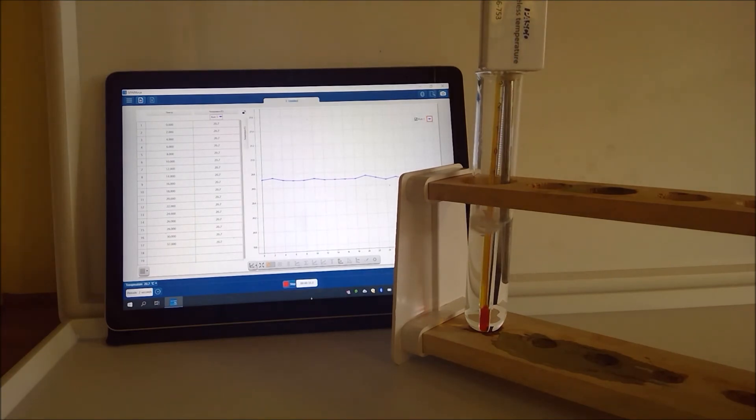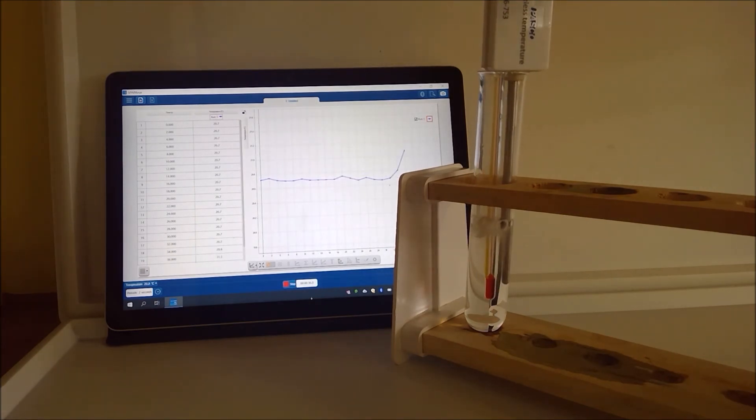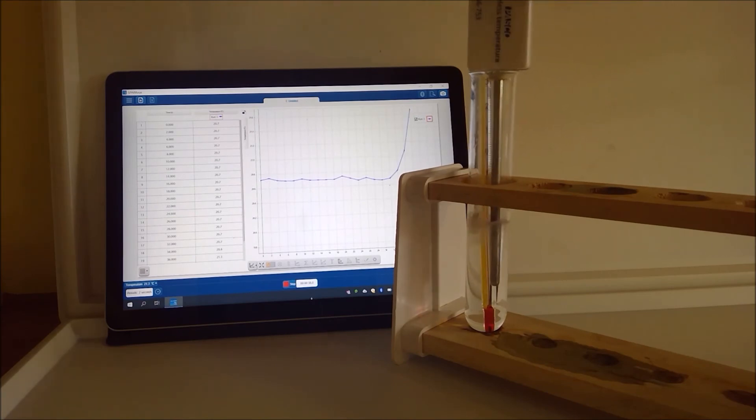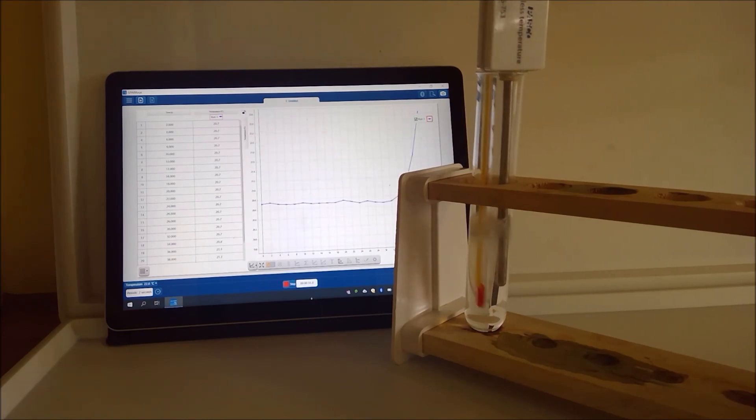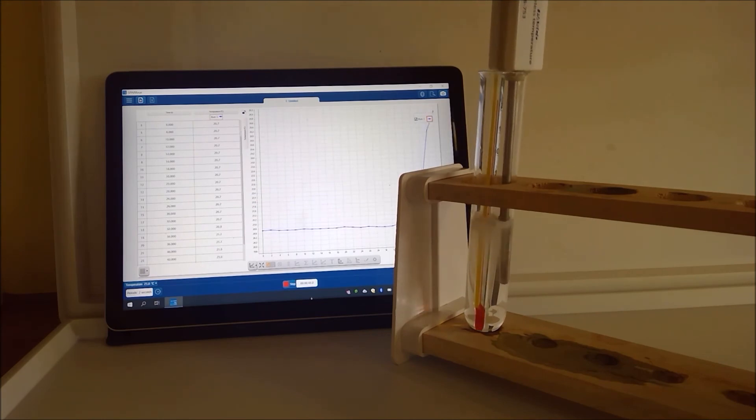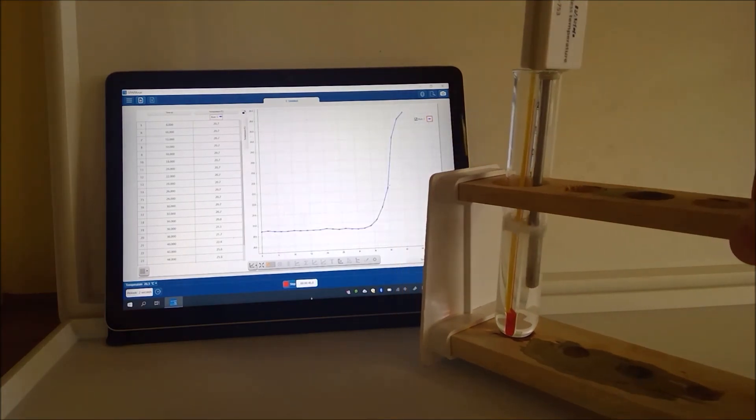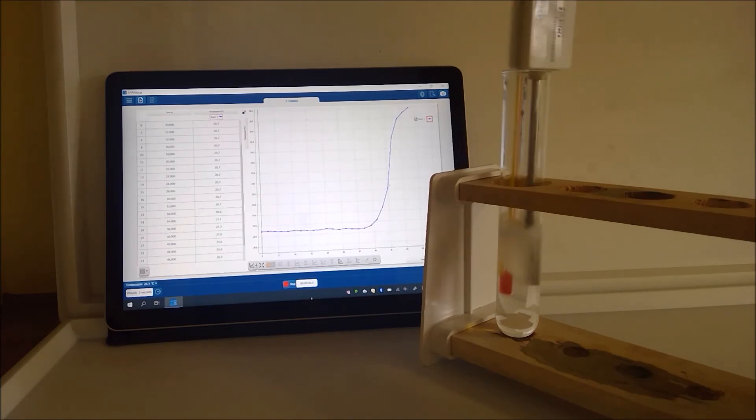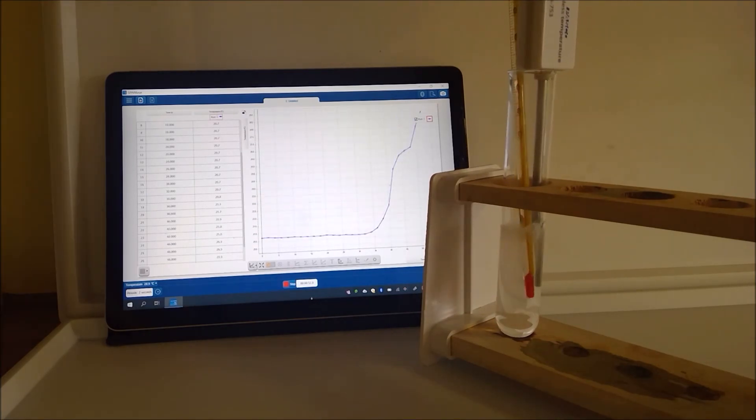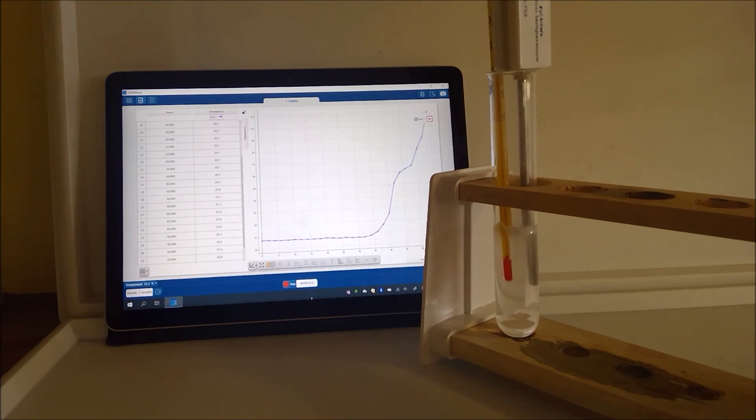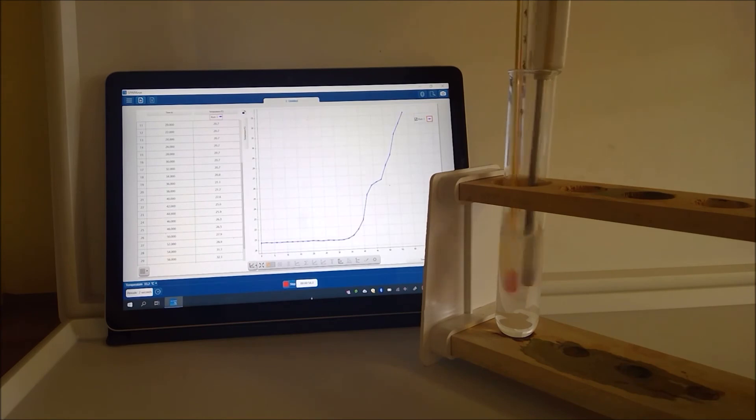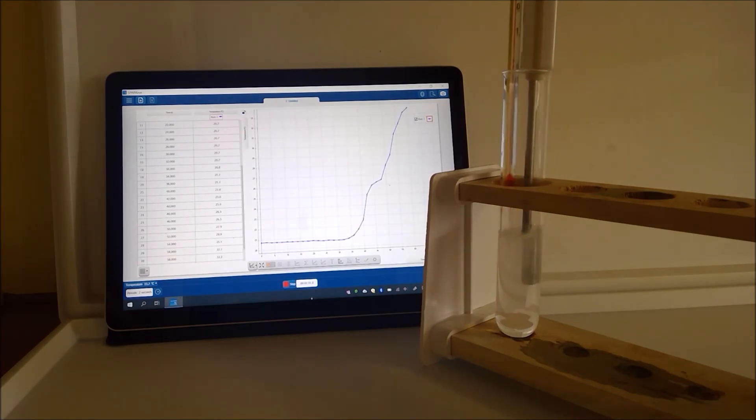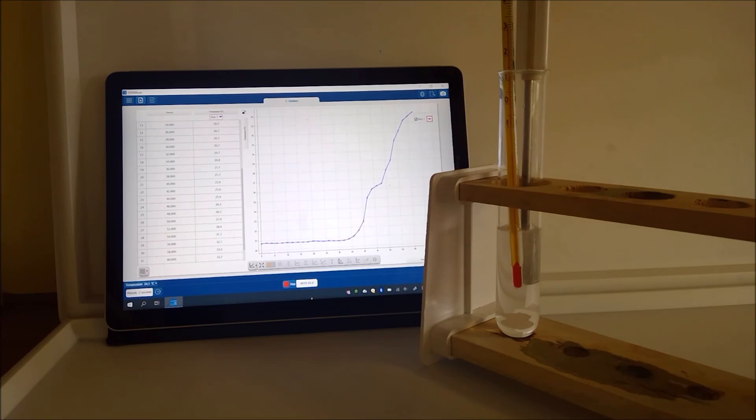Okay hopefully you can hear and you can see plenty of effervescence there. Remember effervescence, that technical term for fizzing. I'll give it a good old stir and then let me move this slightly. Can we see on the data logger the temperature zooming up there. So on the thermometer here I can read about 30 degrees already.